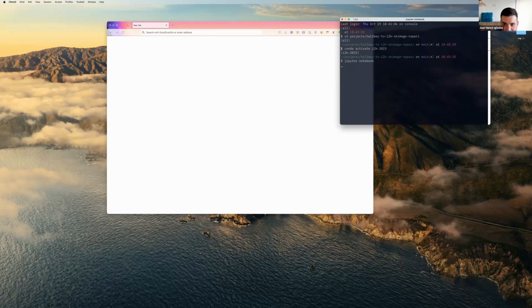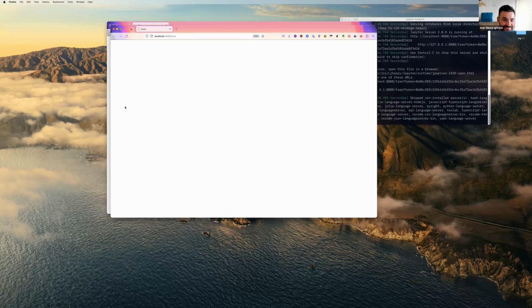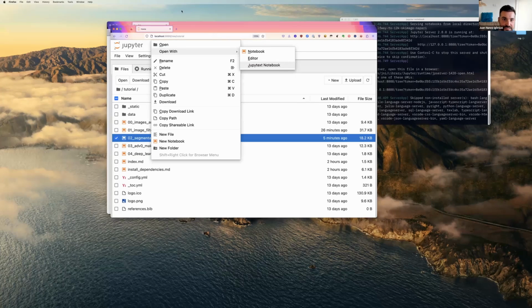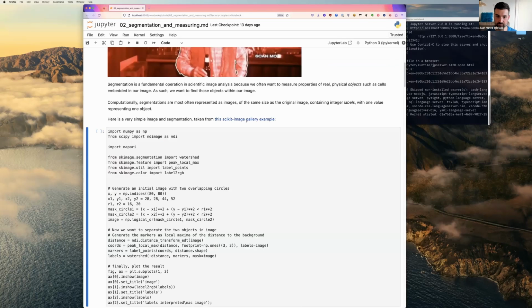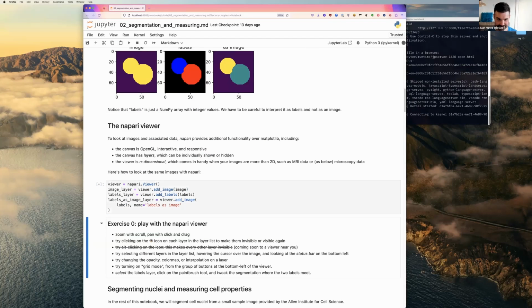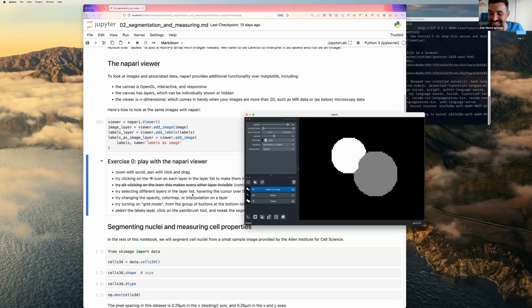I hope everyone's got their fingers crossed because I don't know what's going on. Click open with. Working. All right, I hope you're all cheering at home.